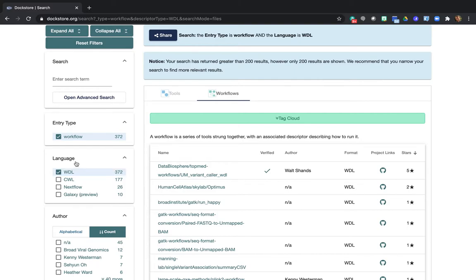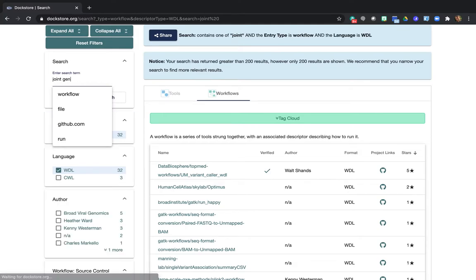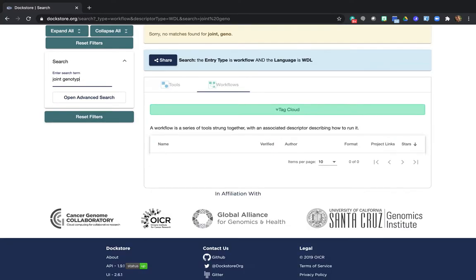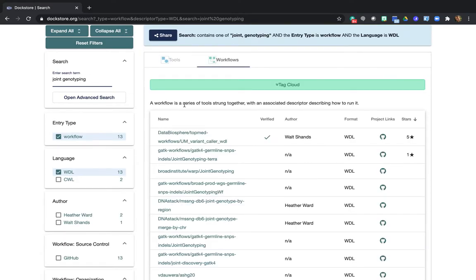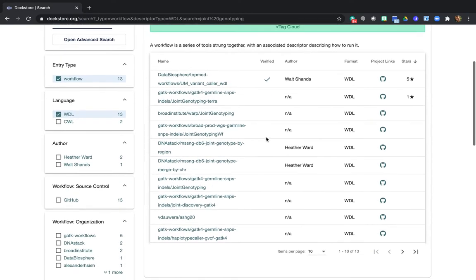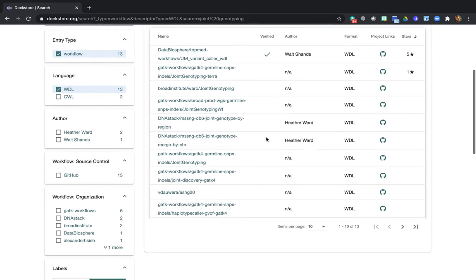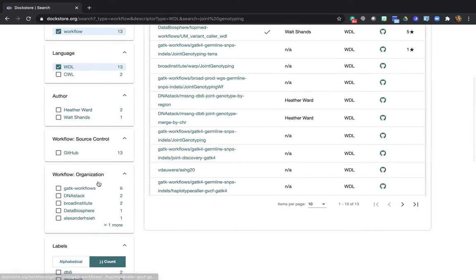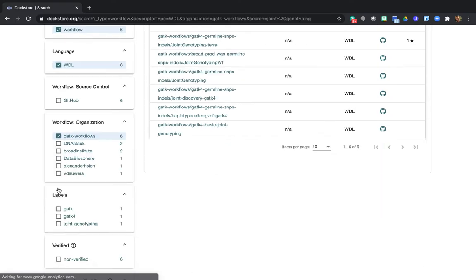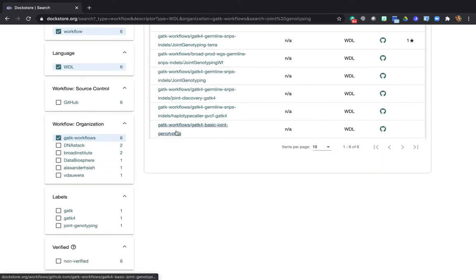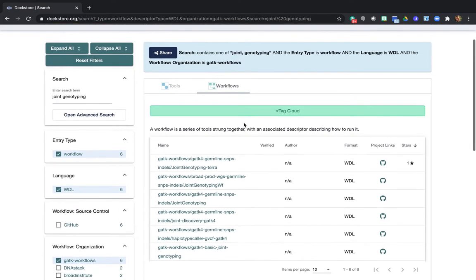So we're looking for a joint genotyping workflow. So let's try typing joint genotyping up here in the search box. Okay, so we get a bunch of results, but that's a bit too much. So we can narrow down the selection and specifically here in the box that says organization, we'll check off the option for GATK workflows, which is a collection of workflows that are published by the GATK team.